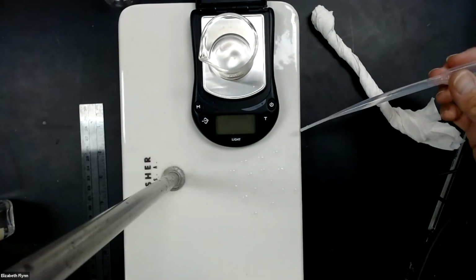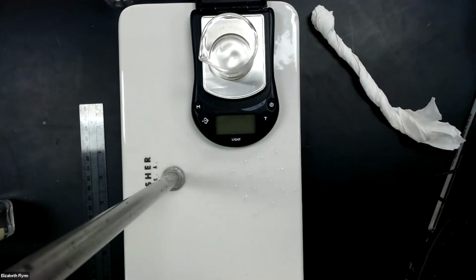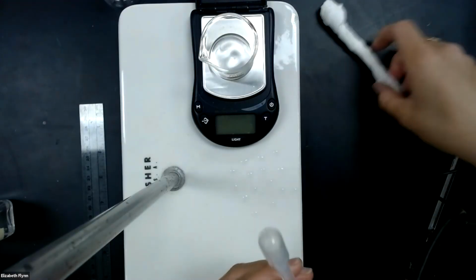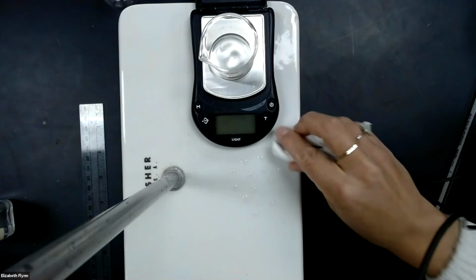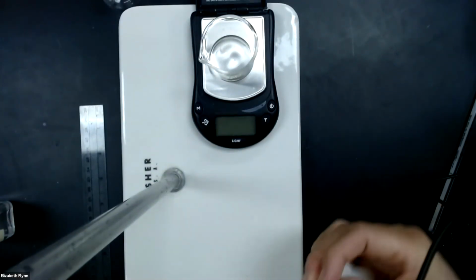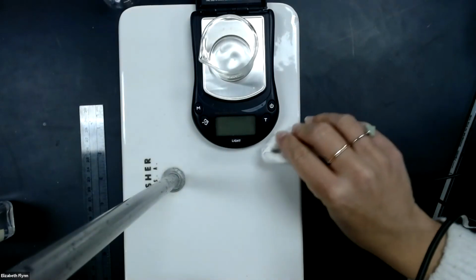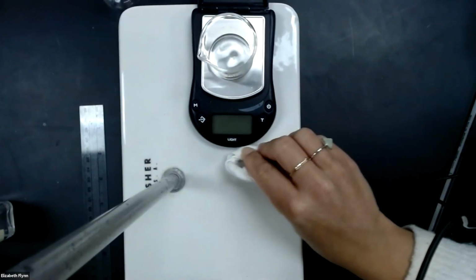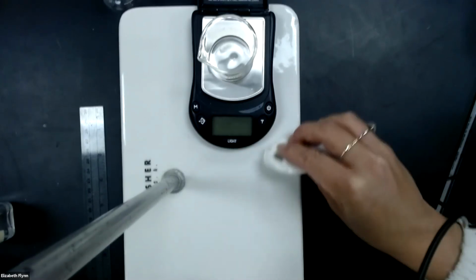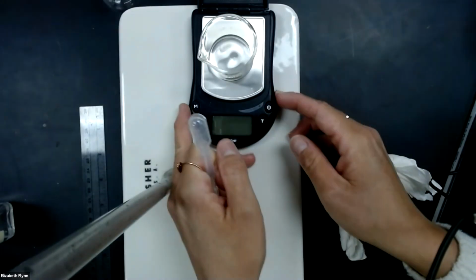You can draw more water into your pipette over on the side over there, right? And just make sure that maybe you fill it up to about that line right there where it says 2 milliliters. Then you'll know you'll have enough. So I'm going to wipe away my drops of water that I did for practice. And again, you want to get the same size drops so that your average drop mass and therefore drop volume is more accurate.